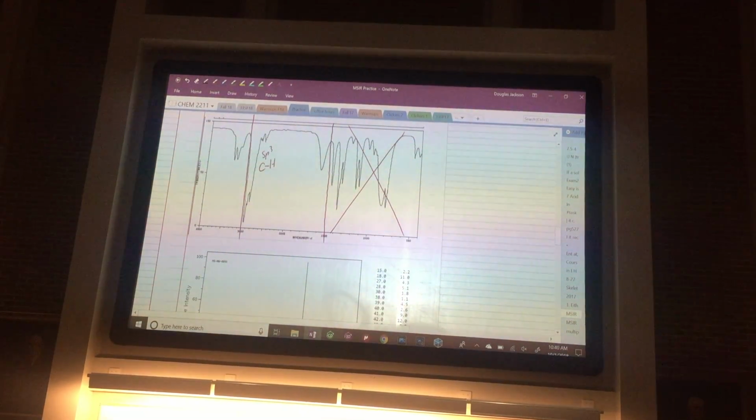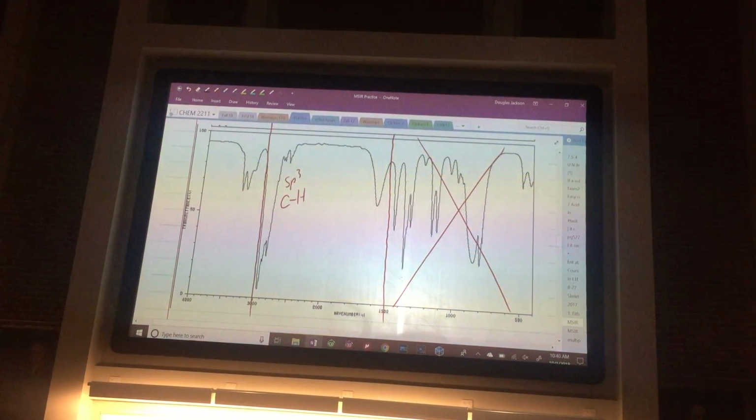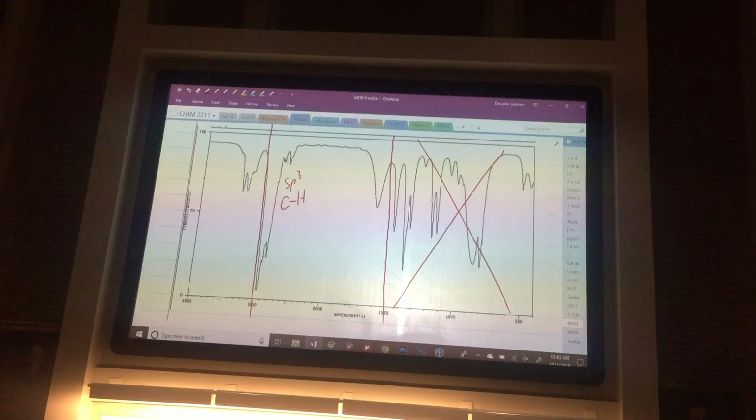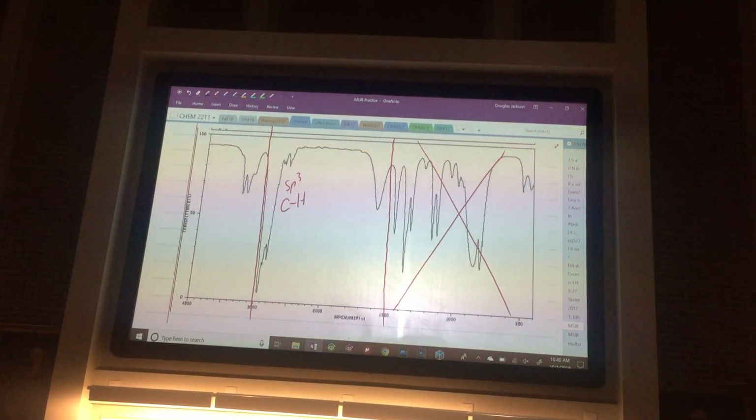that you find there. If you don't have the packet with you, all you've got to do is write down the information from each spectrum and then go back, look at it on ELC, and match your notes. But the main thing is to look at this, listen, and understand the process here. All we're doing is looking for functional groups to start with.